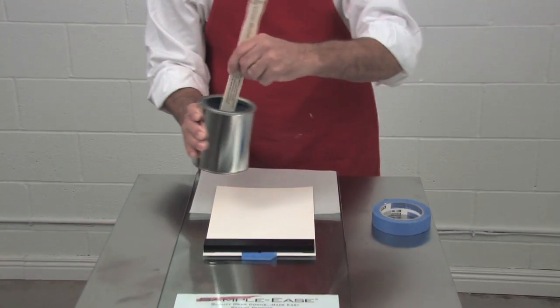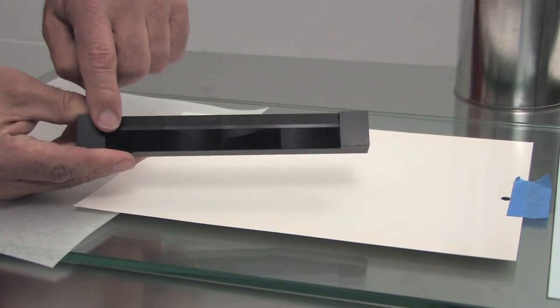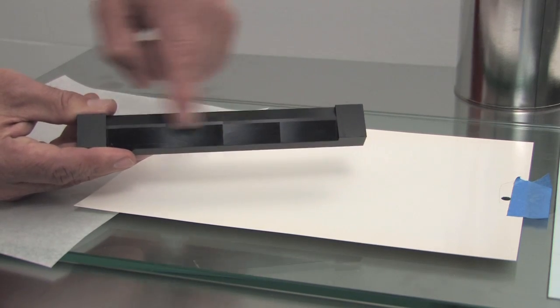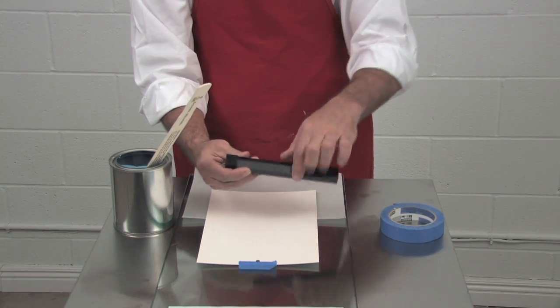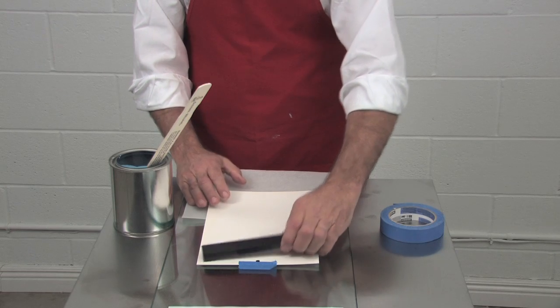Then apply your paint. The drawdown bar itself has two feet, and in between that is the bar that does the drawdown. So you want your paint to fall within the feet — do not go out onto the feet, it should be between them. And you can see that while you're pouring the paint.